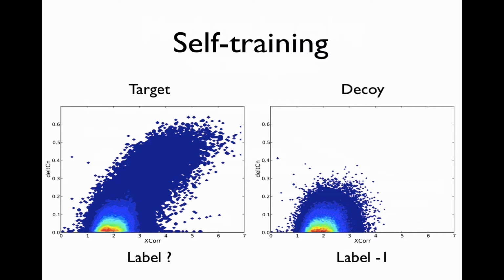So now we could use any of the scores here to start to threshold identifications. Say that we use the XCorr score first. We could threshold all our PSMs to a level where we reach a Q value or false discovery rate of 1%. If we use this threshold, that is to say that there are 100 times more correct identifications to the left here than in the square to the right.